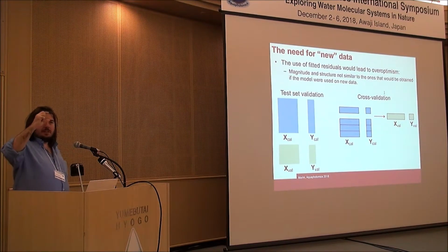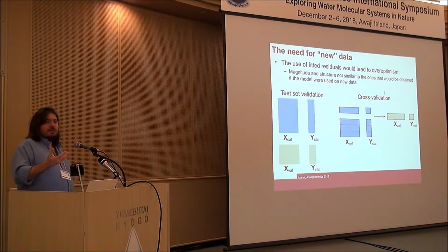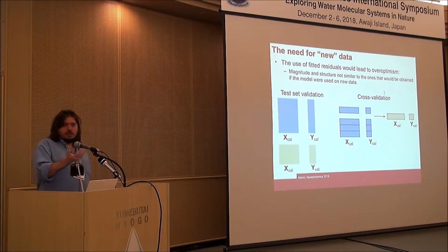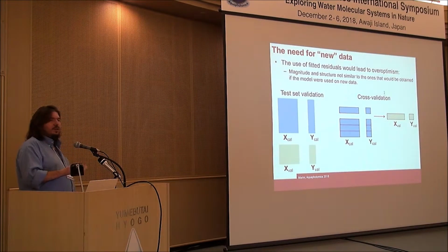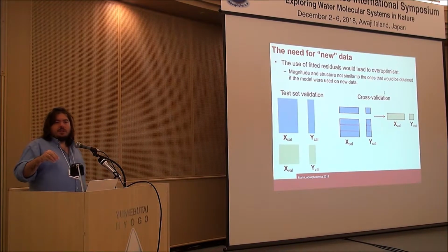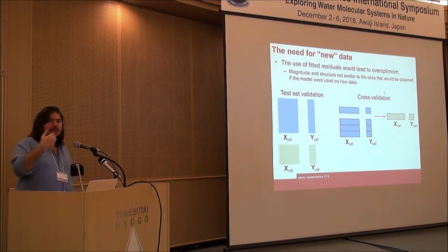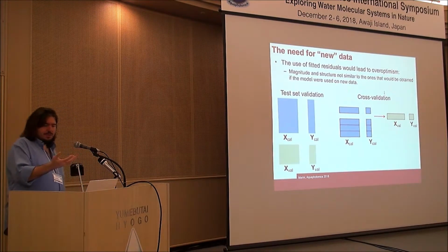Because both the entity, so the dimension, and the structure of the residual that we have from our modeling set will never, or let's say almost never in practice, resemble the structure and the entity of the residual that we may be expecting when we are analyzing new data. And this is inherent in the kind of models that we build. So it's like Snow White's witch mirror. It will give us the answer that we want, the over-optimistic answer.